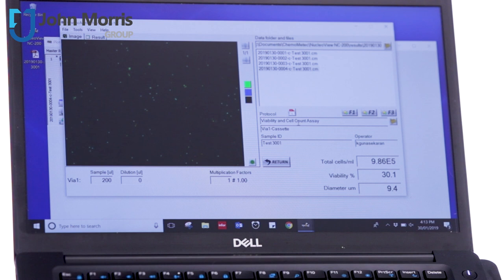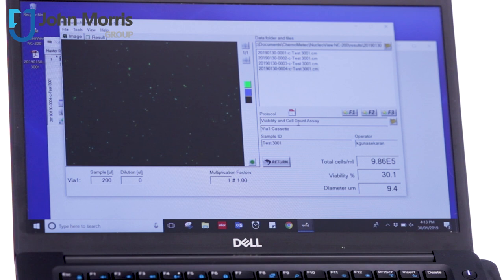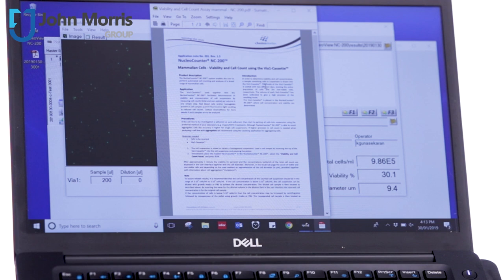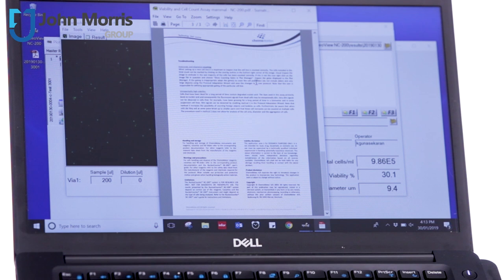And if you're not quite sure what any of those assays actually are, if you click the protocol button here, it'll actually break it down for you and show you exactly what's involved in that protocol, which is really, really handy.